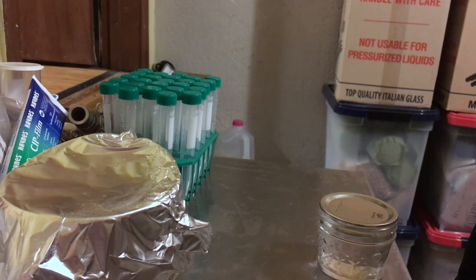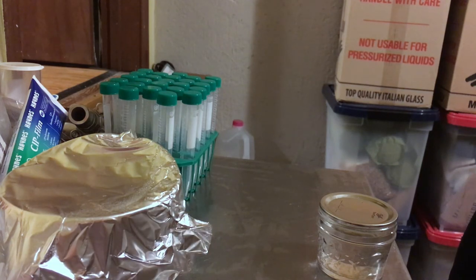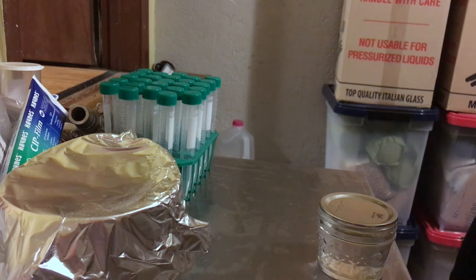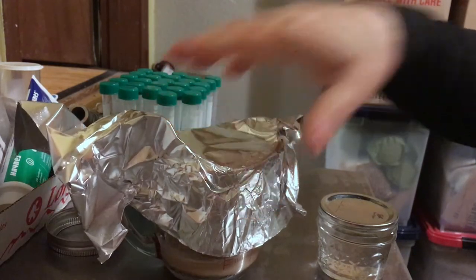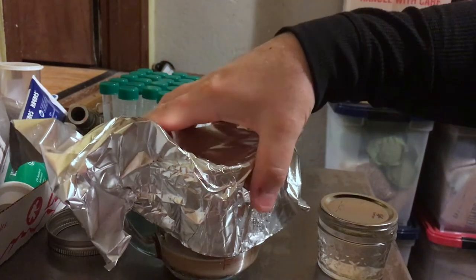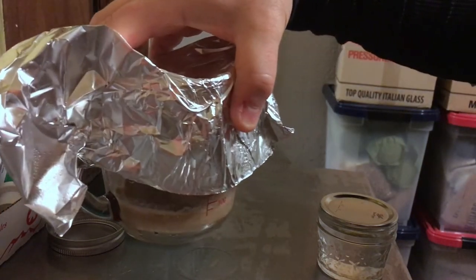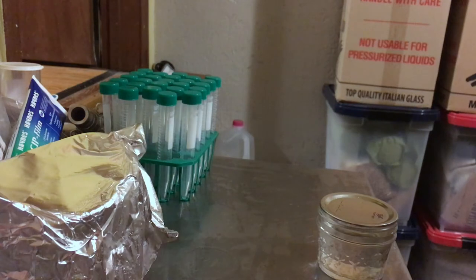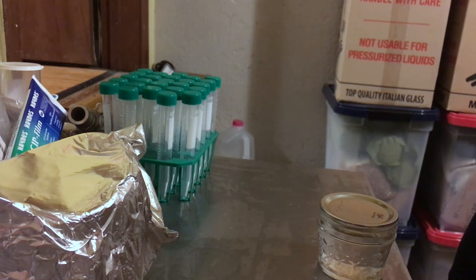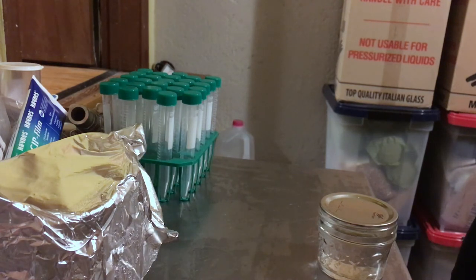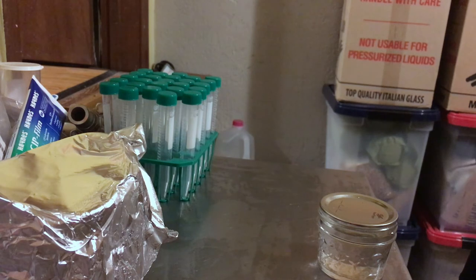Basically what I did is I took the smack pack on Monday night, smacked it, built up a nice big starter, and just cold crashed it today. I decanted off about 100 milliliters of fairly thick yeast that was in the starter and basically split what was there. I started another starter with what was left, so I just finished that. Now I'm going to put that yeast into some tubes and freeze it.